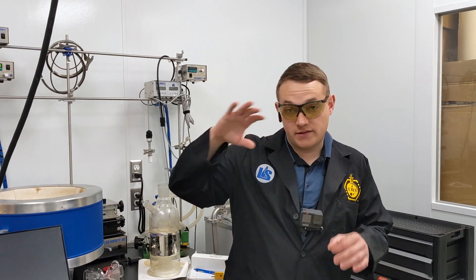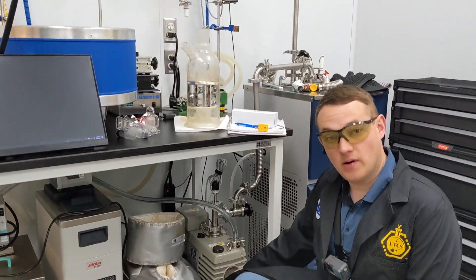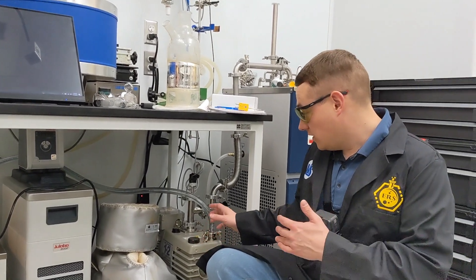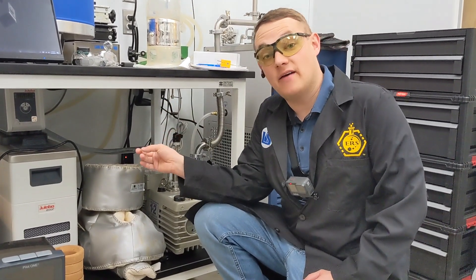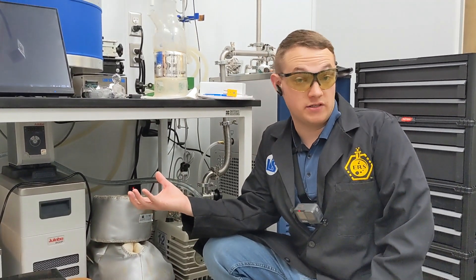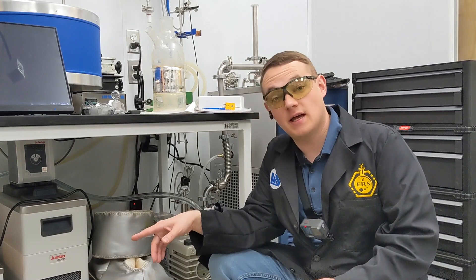There's one other thing to think about: if you're ejecting all those compounds that would normally condense inside your pump oil into your exhaust line, your exhaust line may end up having condensate in it, and so could your exhaust filter. That's something you might have to service more often — you may have to clean out your exhaust line and exhaust filter if you run that way.